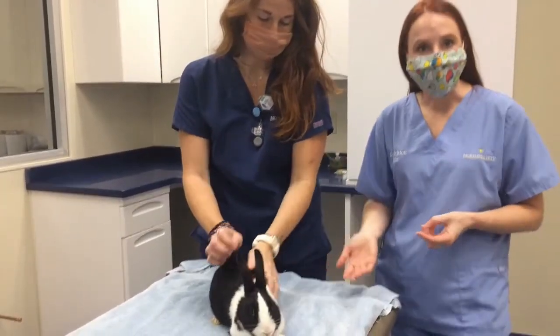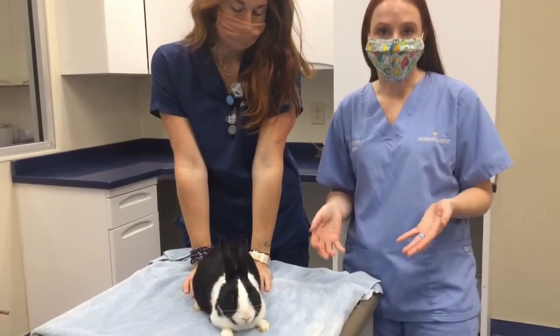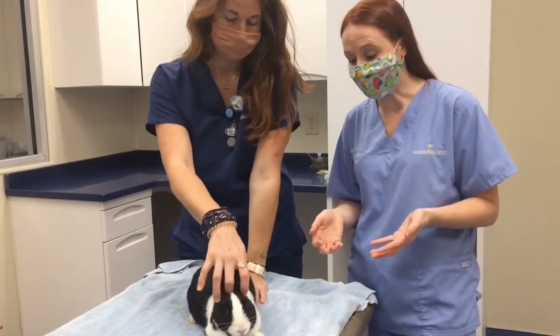Kate and Moo are going to help show how to do some blood draw techniques. There are multiple different ways that we can get blood from rabbits.